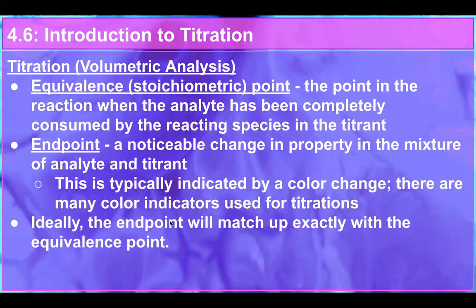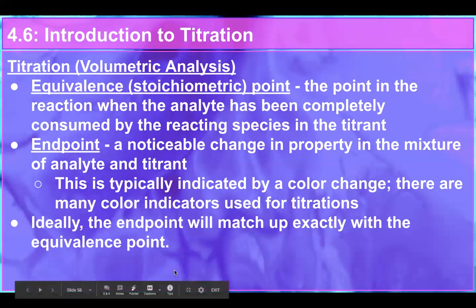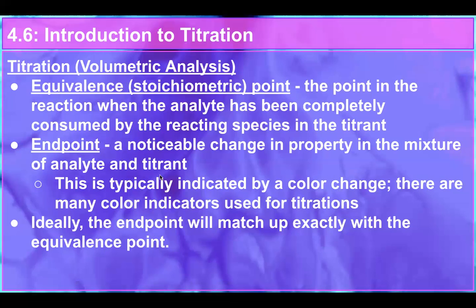So it's a really nice indicator when something turns from clear to really bright pink to show us, hey, stop adding titrant. That's just enough. We don't want any more. Okay, so we are looking for the endpoint, this color change, to match up exactly or as close as possible to the equivalence point.